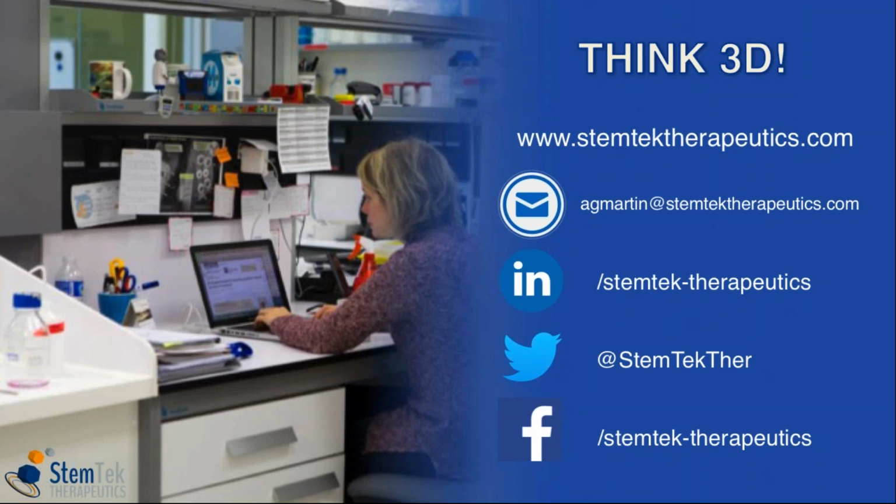And besides, some cell lines will just not make spheroids to begin with. That's described in the literature. So right now we're working with models that we are not actually carrying, like melanoma, head and neck, skin cancers, and some sarcomas as well. But there are several cell lines in the pipeline that will be available soon.